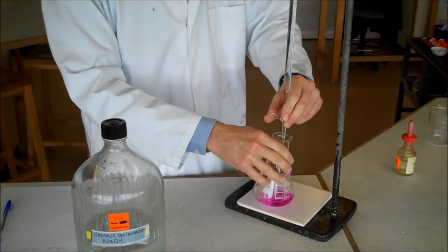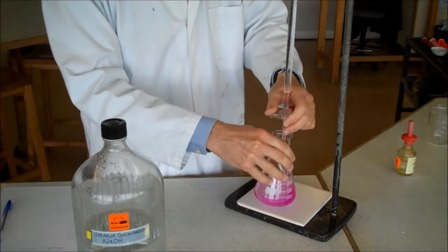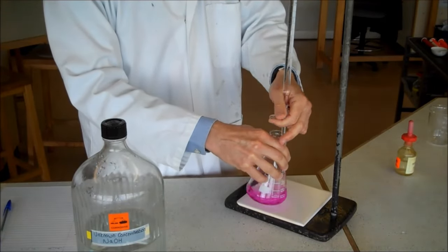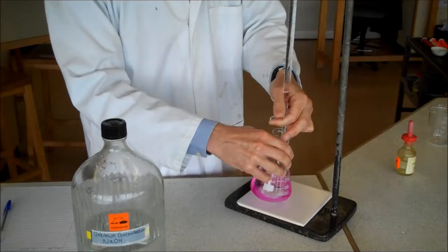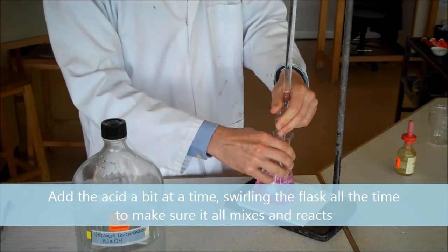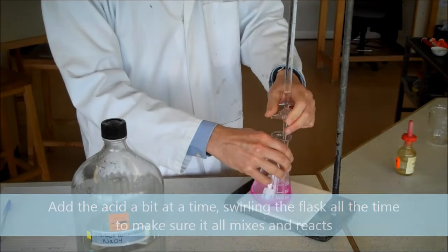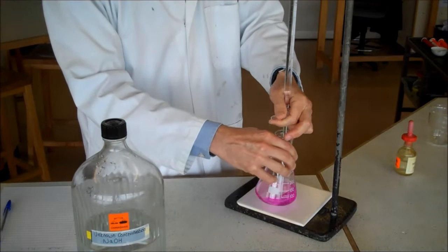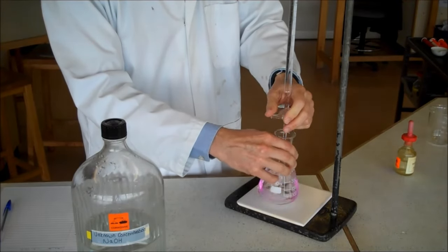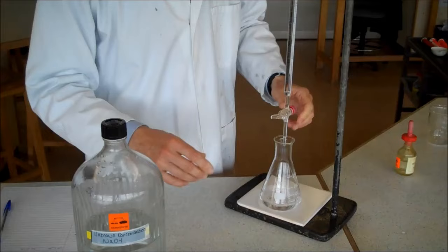Now I'm going to add a bit of acid and I swirl it round to mix it. I keep adding the acid until it goes colorless. I'm adding quite a bit at a time just to do it quickly, but I have an idea roughly of how much I'm going to need to add. And there we are. It's gone colorless.